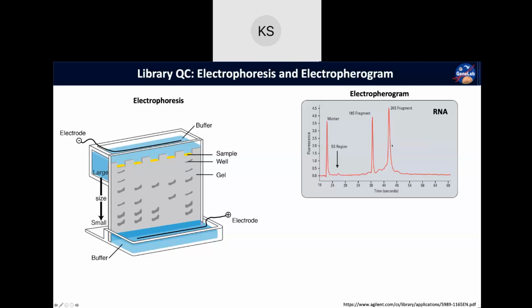And so, of course, when we're looking at our library preparation, do we want to see any of these specific peaks in there?